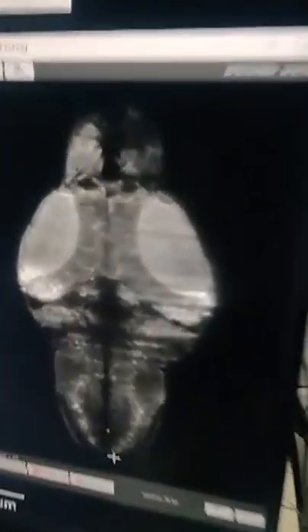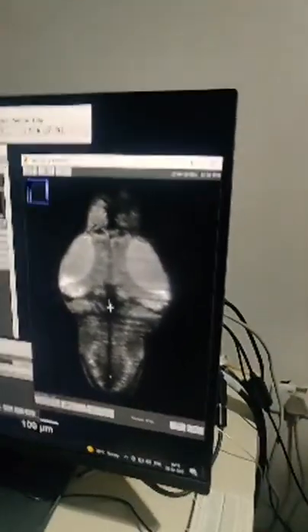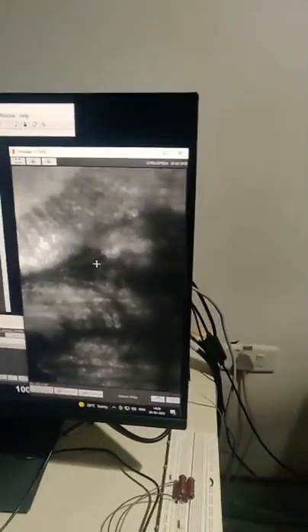Wow. So it is a big magnification. So the brain of the fish is just a little less than 1 mm actually. Okay. So that's how in the previous chamber they were just connected to one of these neurons. Exactly. So they were just looking at one of these tiny cells. Right. Their needles, the pipettes, are so thin that they can go sit on one of these little rings and then look at what's going on inside it.